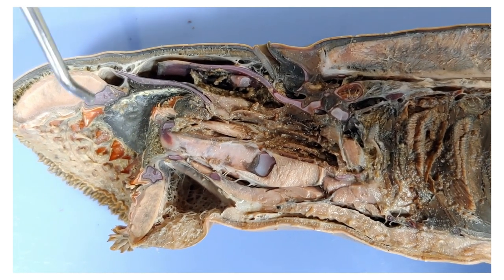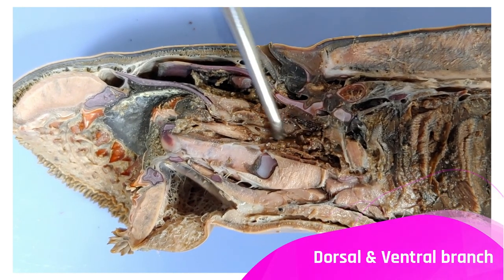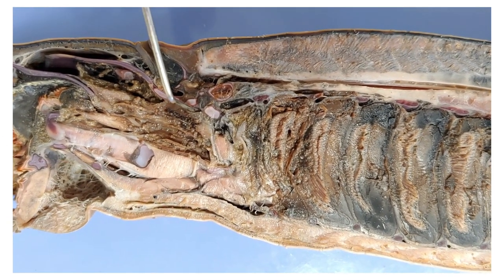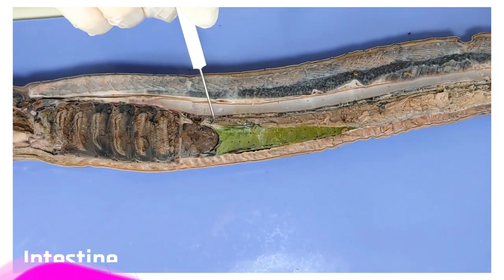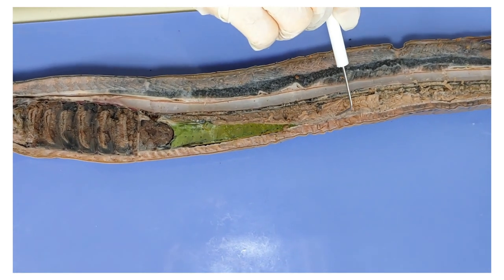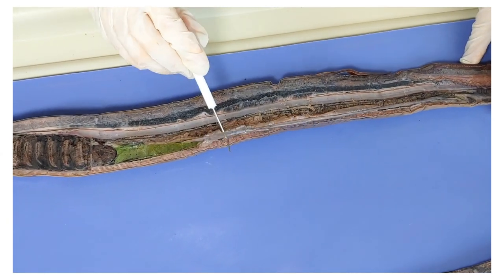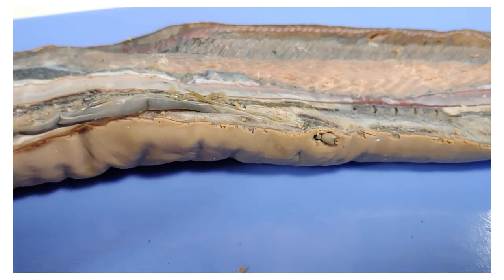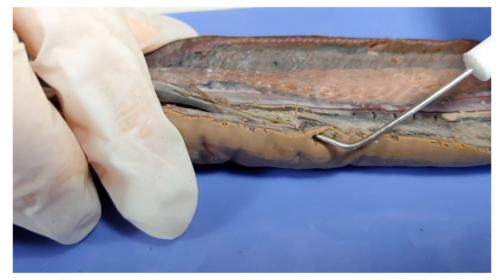Once the lamprey consumes blood or flesh, the food goes down through the pharynx here. The pharynx then branches into the dorsal and the ventral branch. Following the dorsal branch first: it leads into the esophagus, which continues down to the intestine. There's no stomach in the lamprey — it goes straight from the esophagus to the intestine. The intestine runs along the body all the way until it reaches the anus. I can actually pull out the intestine — and if I put my probe in through the anus, it comes out through the intestine.